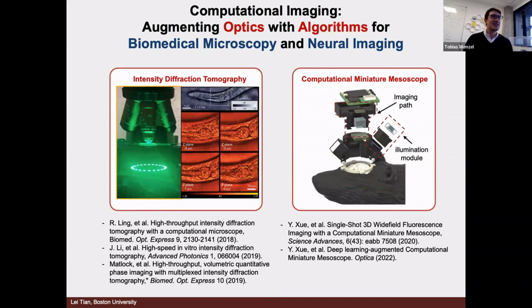You've really inspired me to rediscuss if we can actually get a 3D reconstruction, which would be very helpful. But we definitely need high resolution reconstruction, less than a micrometer resolution. The depth is good, and a large field of view helps us use relatively simple mechanics for scanning the object also.